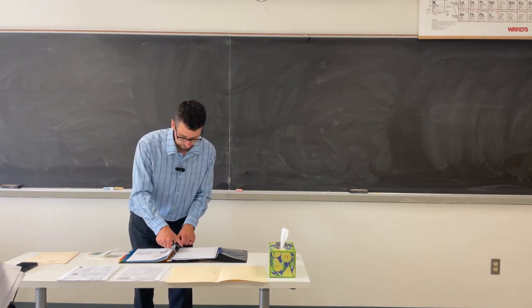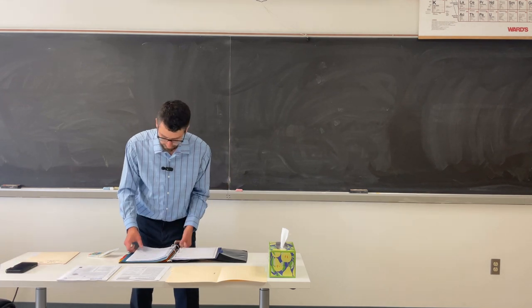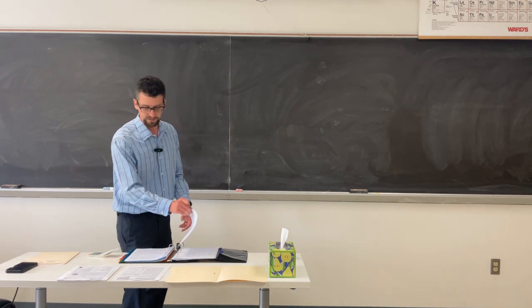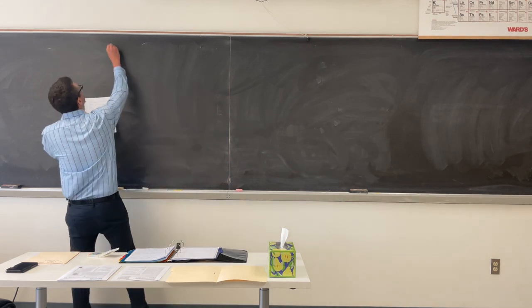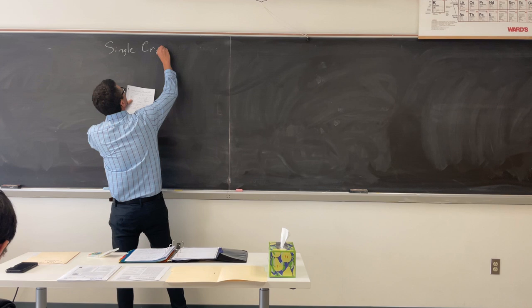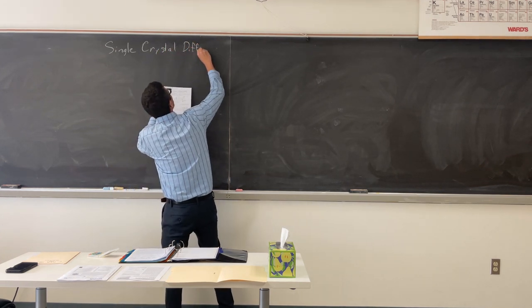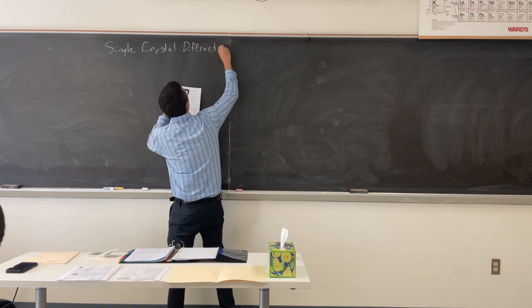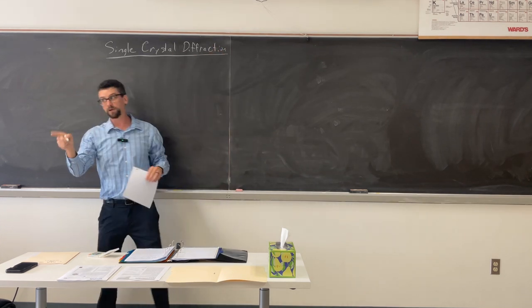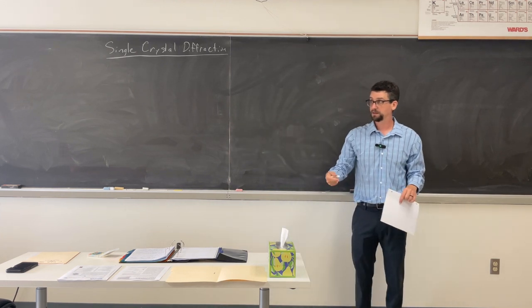All right, so let's talk about the experiment again. What's the difference between single crystal diffraction and powder diffraction? Well, powder diffraction you were hoping has the same lattice.